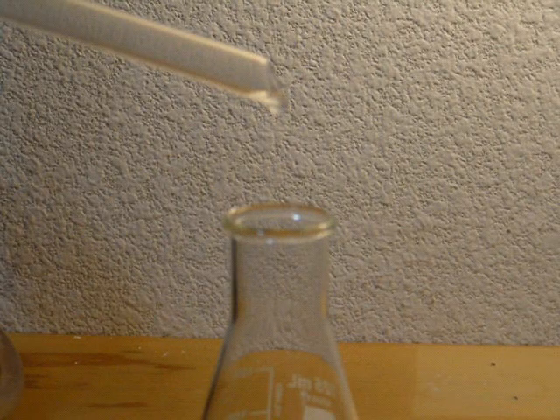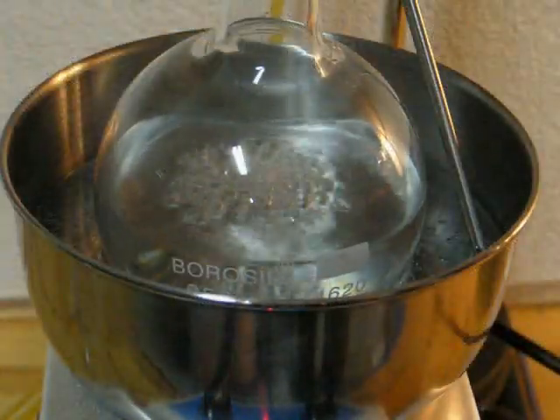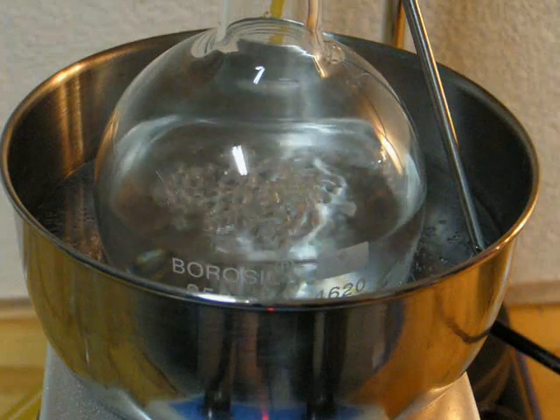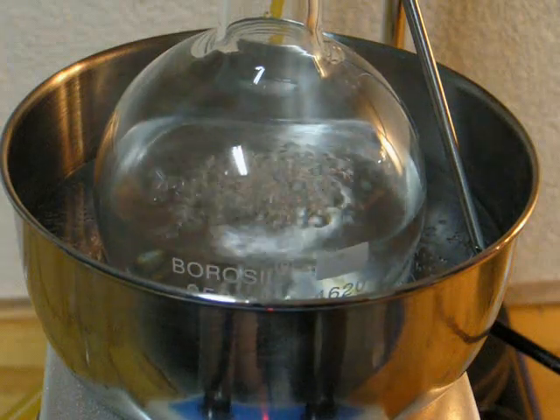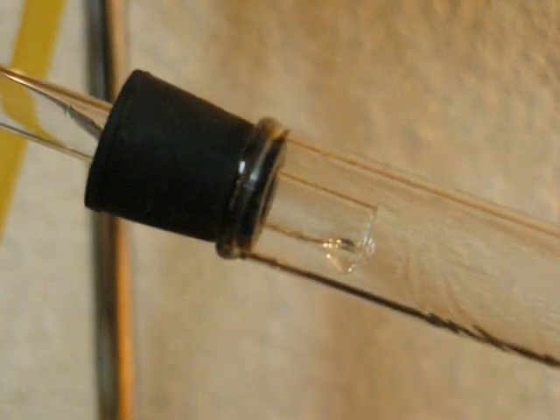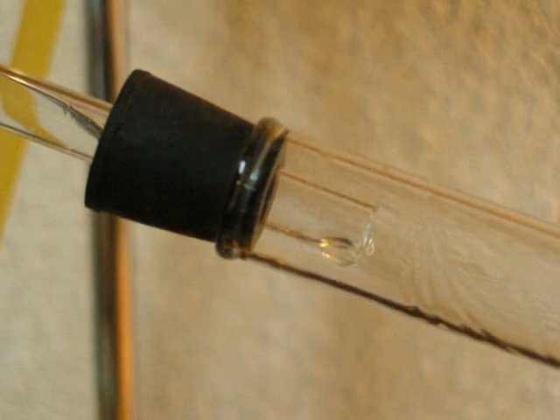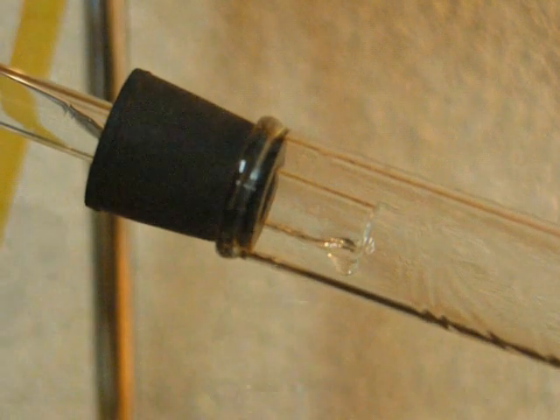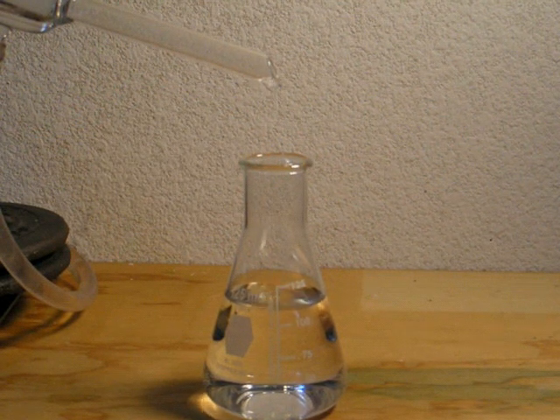Here you can see ethanol dripping into the receiver towards the beginning of the distillation. Here is the flask in which the ethanol is boiling. This is where the sidearm of the distillation flask connects to the condenser. And here you can see ethanol dripping into the receiver towards the end of the distillation.